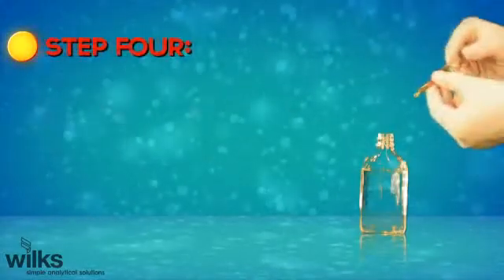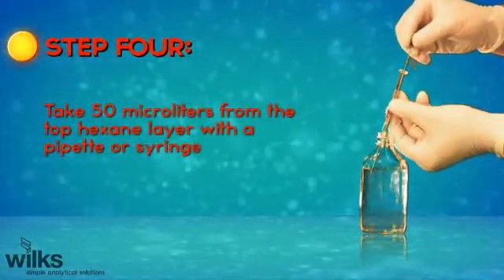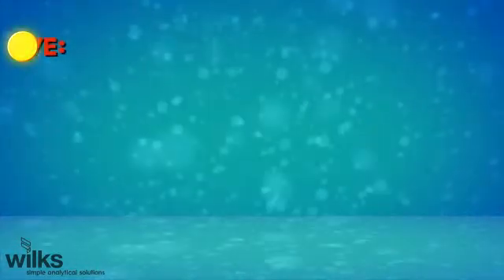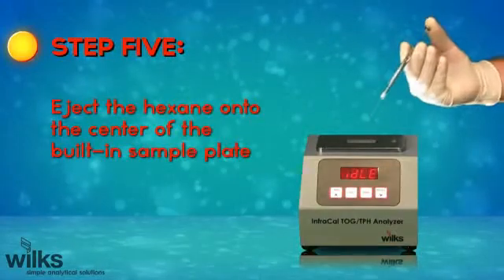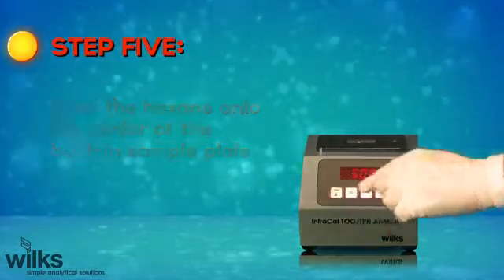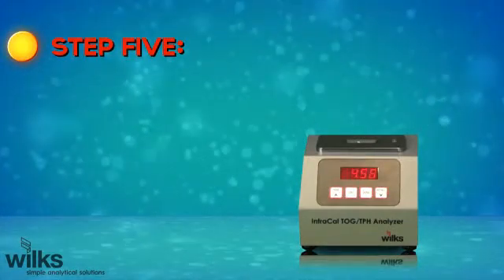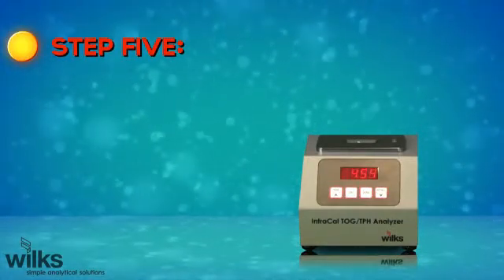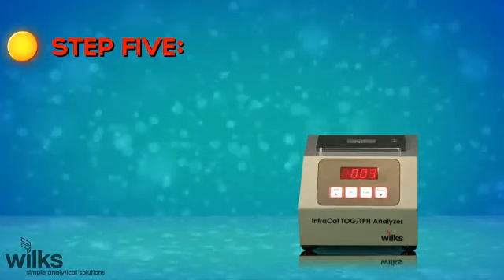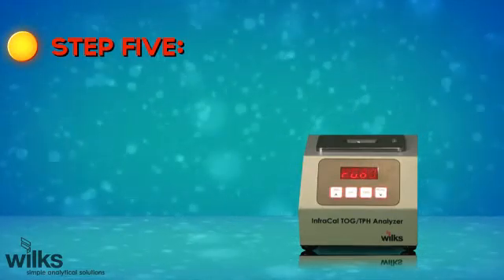Step 4: Take 50 microliters from the top hexane layer with a pipette or syringe. Step 5: Eject the hexane onto the center of the built-in sample plate. After selecting the Run button, the timer countdown will begin. This allows the hexane to evaporate so only the sample hydrocarbons will be measured. When the countdown is complete, the run cycle automatically begins, and in less than 30 seconds the results are displayed.